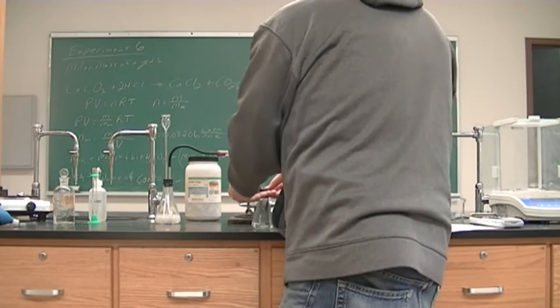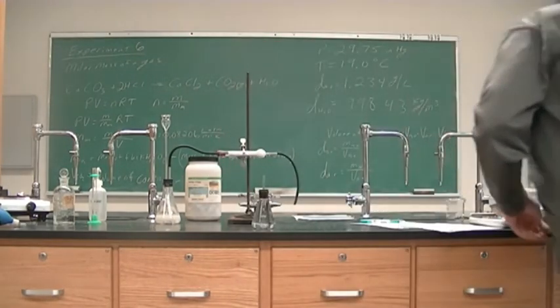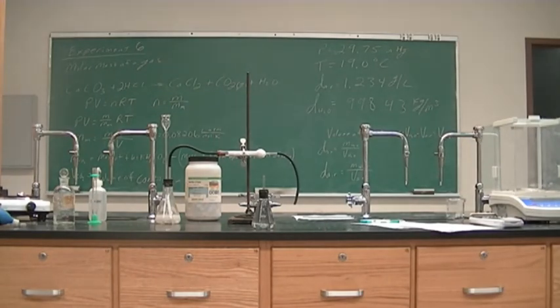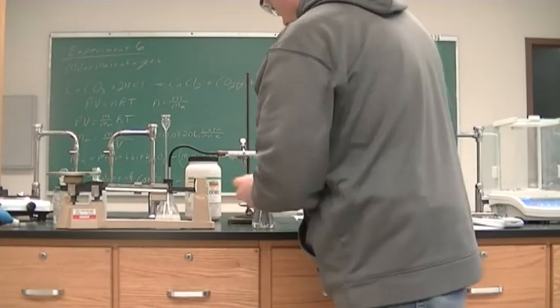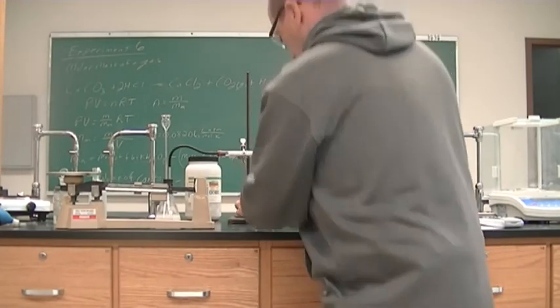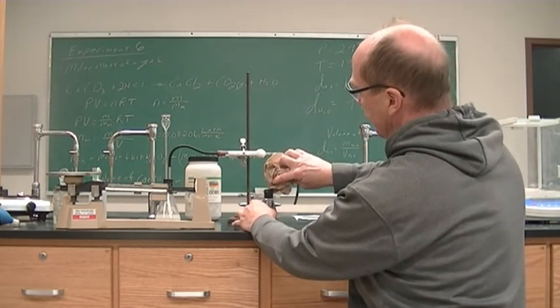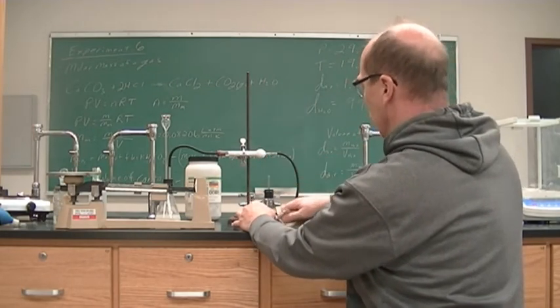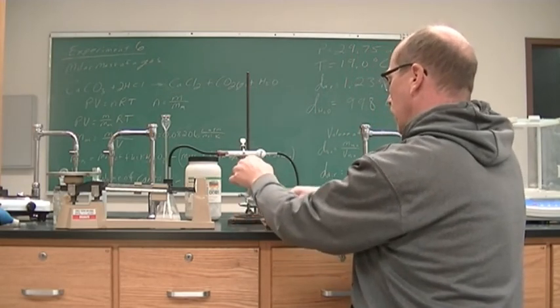All right, so put this on tight. Get some paper towels. All right, now this is wet for one, and for two, it's going to have a pretty large mass. So I'm going to use my high capacity triple beam balance. Again, I have water that's sitting on top of this rubber stopper. I want to get rid of that water. I want to get rid of the water stuck to the side, stuck to the bottom.